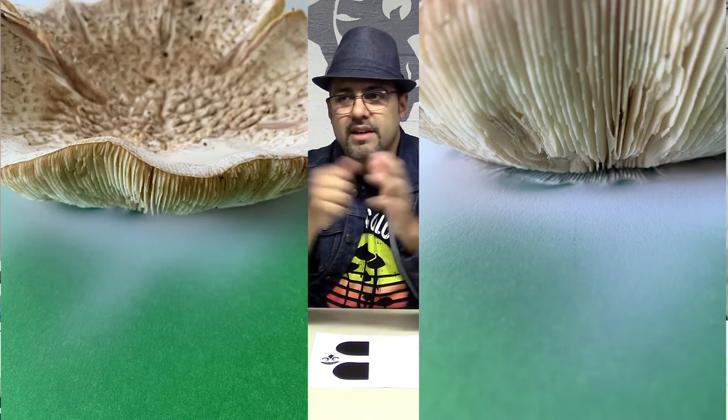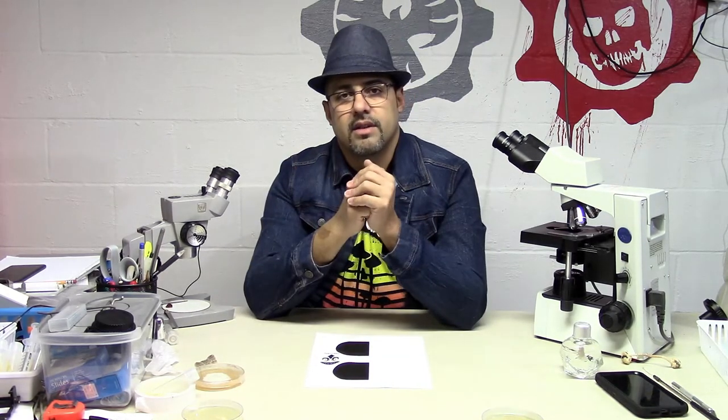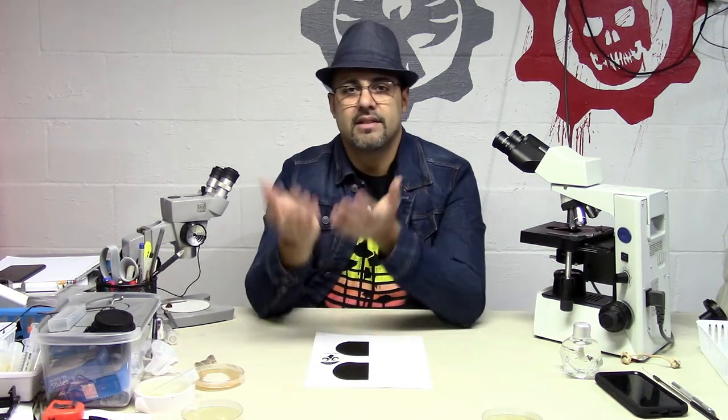Groups like Amanita, or Amanitaceae — the family Amanitaceae — are white spore mushrooms. So let's say you don't know how to start identifying a specific mushroom. You can just start with a spore print, and then if you are looking in a dichotomous key, it will probably tell you the color of the spores, the color of the spore print, and then it segregates them — either they are white colored, pale, or dark colored. So you can see the difference right there.